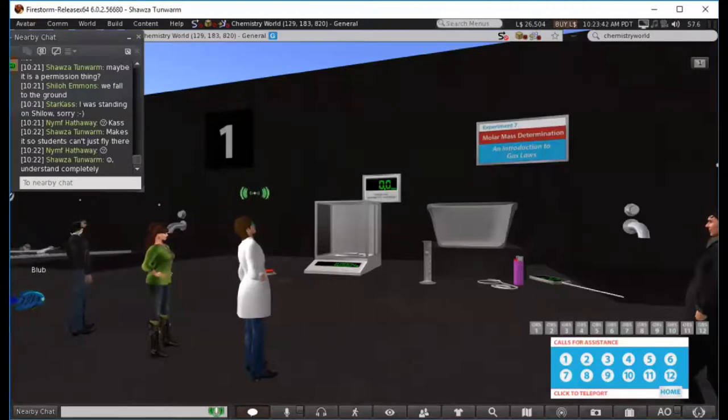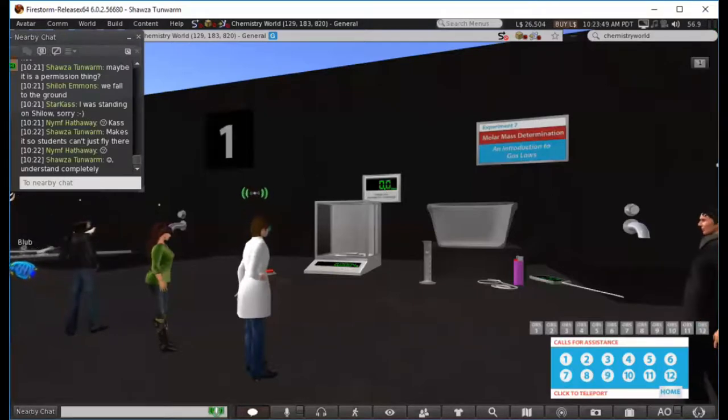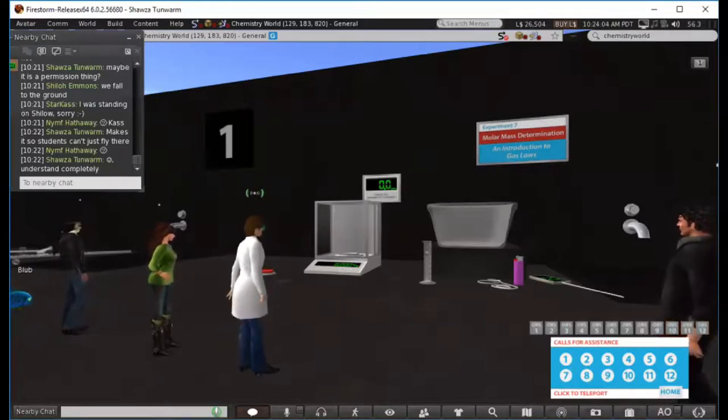And this is a very important concept in freshman chemistry. It's sort of a theoretical idea, and this is a way for them to actually go about collecting data where they can calculate this value associated with the chemical. The chemical they're talking about is butane.